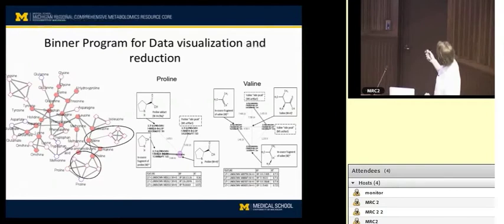The way you would know that is that it would have a mass that's lower than your compound of interest, and then you could figure out what the difference was and say, does that correspond to some fragment, or some loss of some group that makes sense? Is it a loss of water? Is it a loss of COOH? Is it something that makes sense with my molecule of interest?